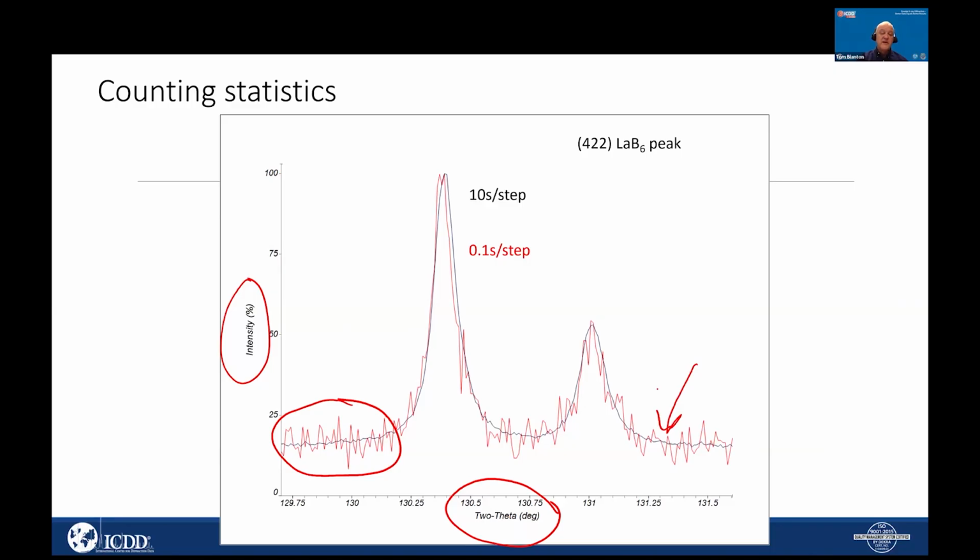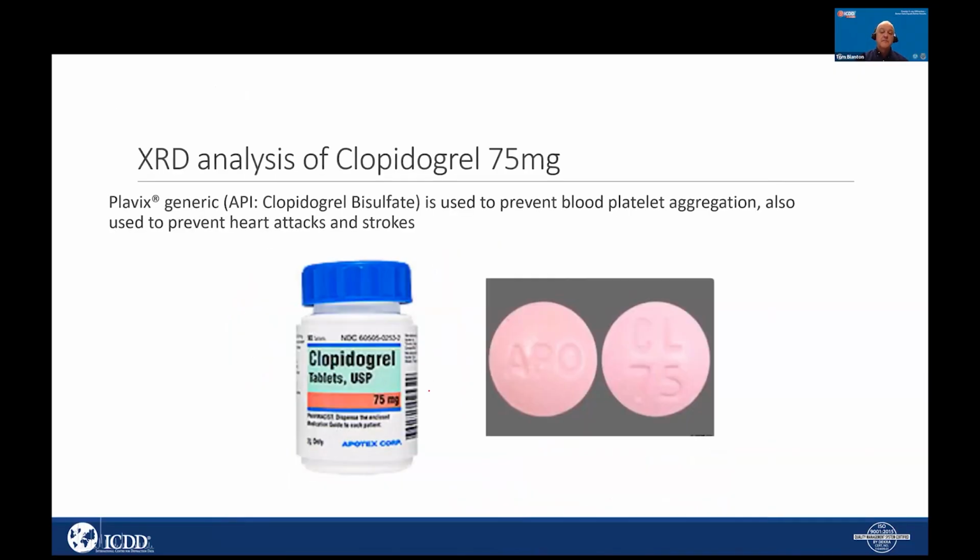And you really see very little variation, statistical noise. So this is really what the counting statistics will do for you. Even though the general peak shape is similar, if you try to put this through some kind of automated peak searching, because they use either some kind of first or second derivative algorithm, it will have some problems where you get some of these spikes in terms of getting accurate peak determination.